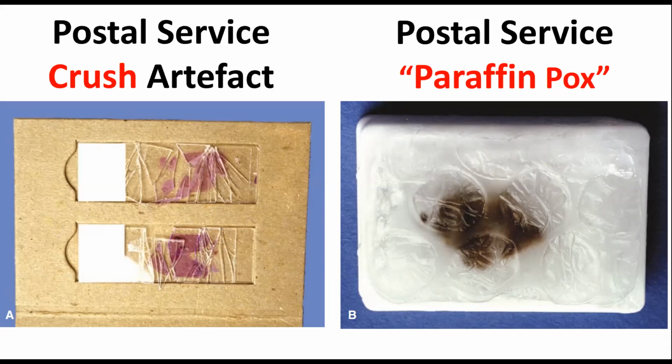On the right, again, this is something we see here in Texas. You're not going to get it so much in New York, but you will in August in New York. Maybe you never get it in California because California is so perfect. The weather. This is when paraffin blocks are shipped in summer in a hot state, and the bubble wrap deforms the block, and it can be so deforming that the block can't be faced. And what the histotechnicians will do is simply melt it down and re-embed the tissue and cut it. Isn't that fascinating? Yeah, that's not minutia, that's essential detail.